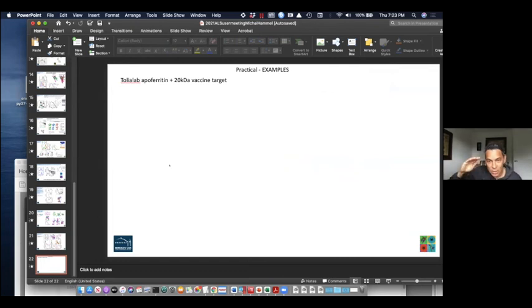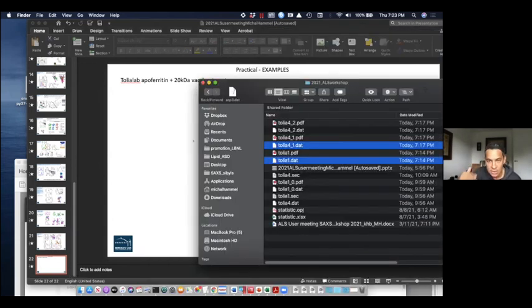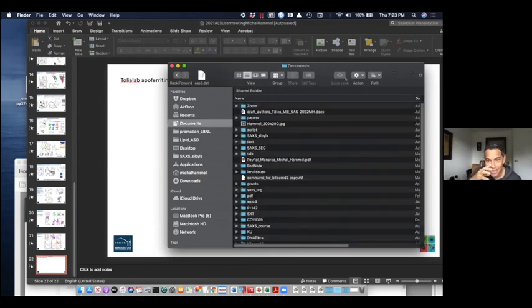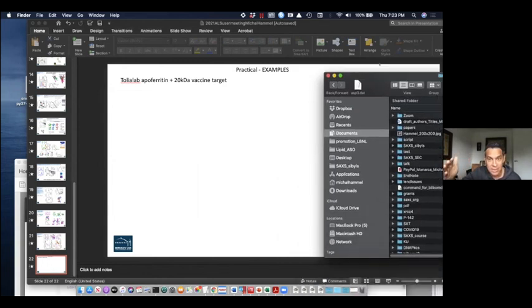If it's on the order of 8 amino acids and it's a monomer, an 8 residue peptide, you're really just going to measure a Guinier region. Then what you're really thinking about is, if it's going to aggregate, can I distinguish the dimer from a trimer, et cetera? That really depends on how the Rg is going to change.